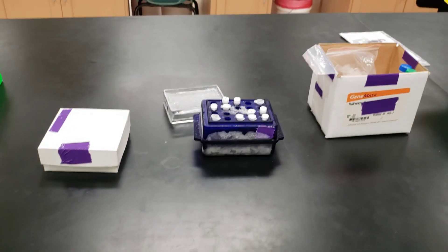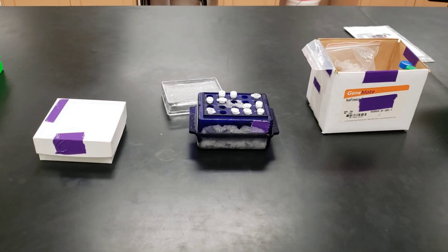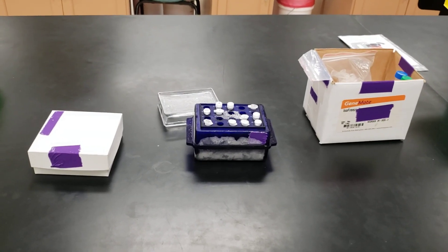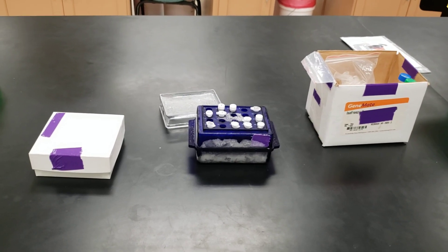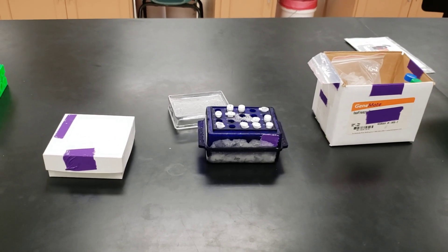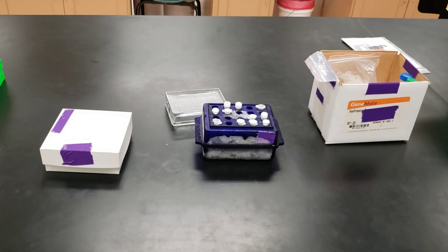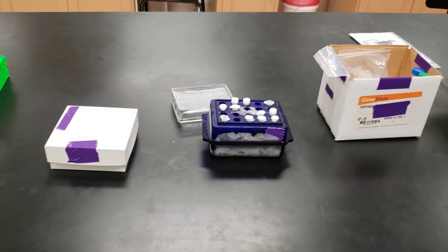I'm very big on working with a sense of community and ownership of materials. Everybody at the Tuesday table uses purple-labeled material, so everyone is responsible for making sure those materials are used correctly. If they run out, you have to tell others because that is your group's material — you cannot take from a different box. Students also put purple labels on their notebooks, so I know which day they come in.